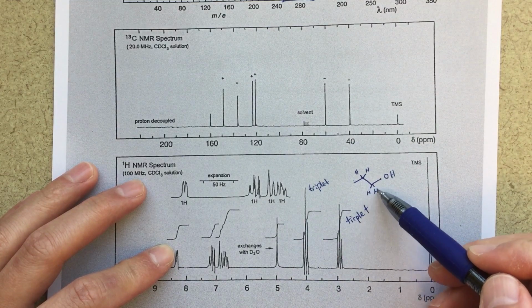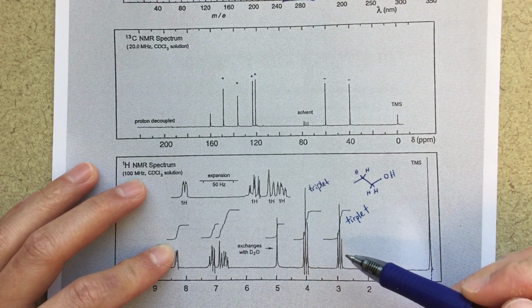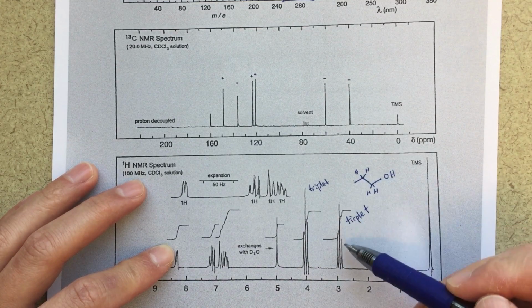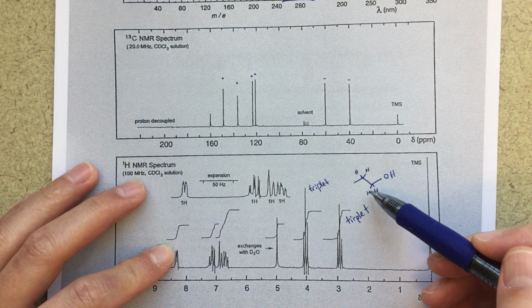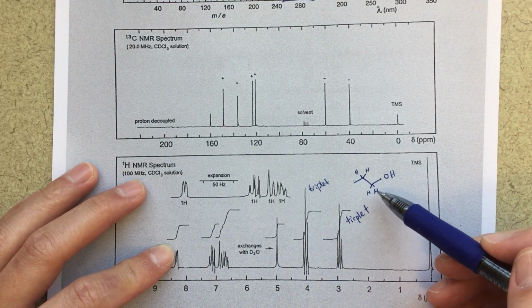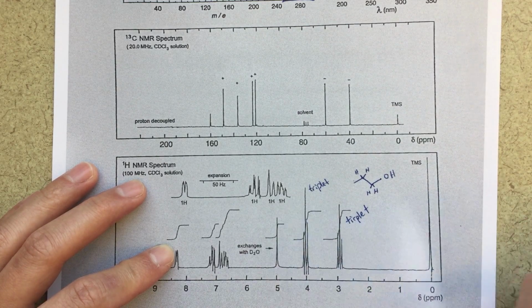So these protons here, those are going to be for this signal here at around 4, and then these protons here, they're going to be that signal here at around 3. This oxygen is going to shift this more downfield, right? This signal should be further downfield because it's next to the oxygen, and then this is my OH.